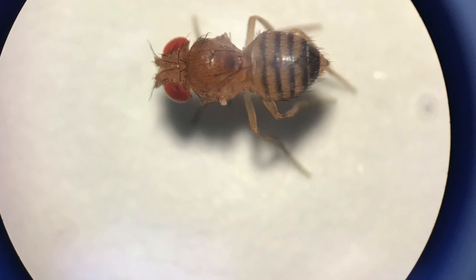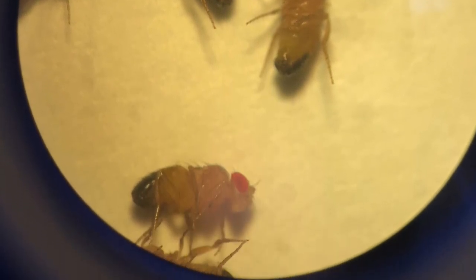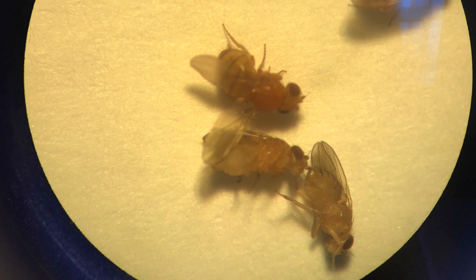These varying results could be due to some flies not being counted because they were stuck in the media, or even some flies being counted twice. Also, there were larvae in each test tube when extracting the flies that were not accounted for because they were not mature enough to sex. But despite the results, we were on track with the Punnett squares and their results.